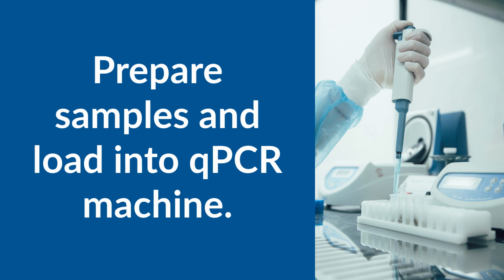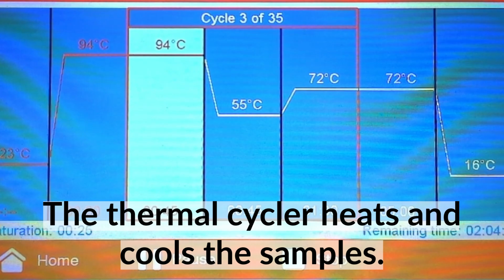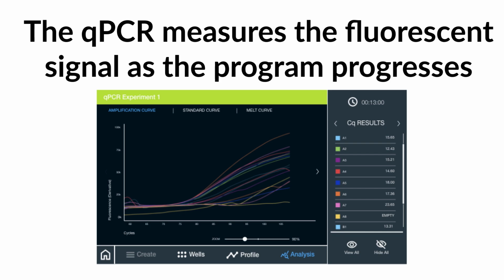Here's how it works. First, all the components are combined into small, optically clear PCR tubes. The tubes are placed into the thermocycler. The mixture is then heated and cooled in cycles. The heat separates the DNA strands, and the cooling allows the primers to bind to their target sequences. After the primers bind, Taq builds the new DNA using the sample DNA as a template.